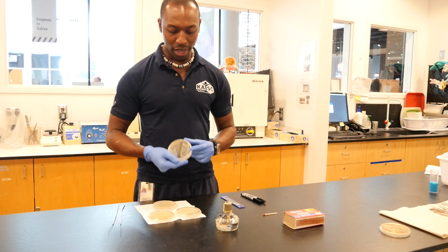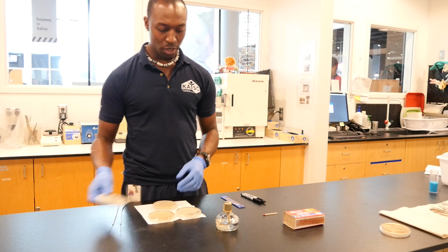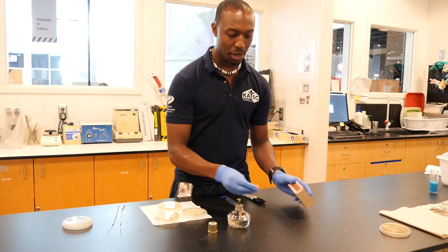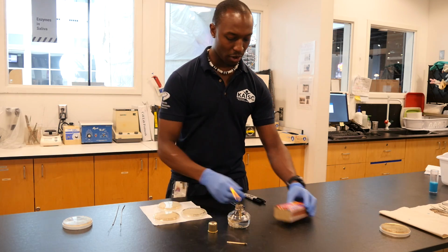And as you can see right here, this is going to be the end product, how the culture should actually look, okay? So what I'm going to do right now is burn my alcohol burner, right? Get it burning for myself. I'm going to keep that right there.